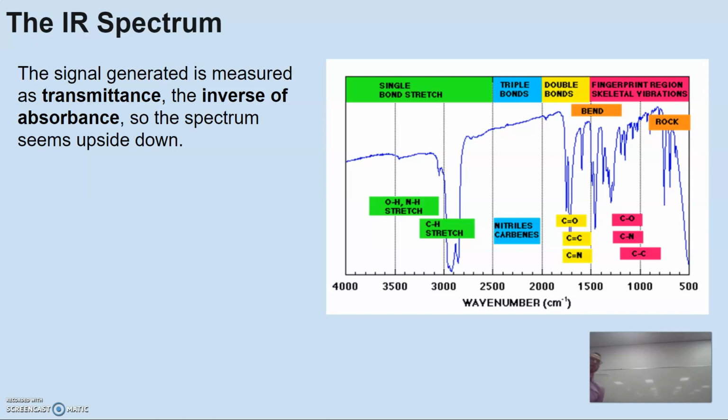What's different about that? Okay, so you're talking about the shape of the graph itself? Right, what about the graph itself if I remove this? What's different? The x-axis is backwards. Yeah? Well, it's the inverse of the wavelength. So the smaller the wave number, the larger the wavelength; the higher the wave number, the smaller the wavelength.